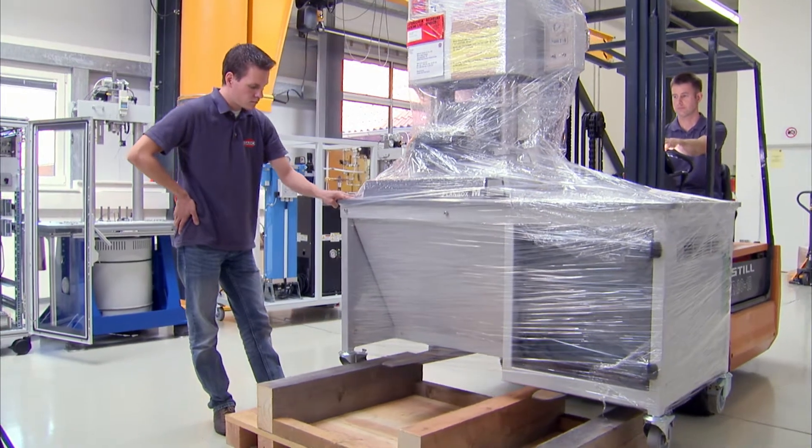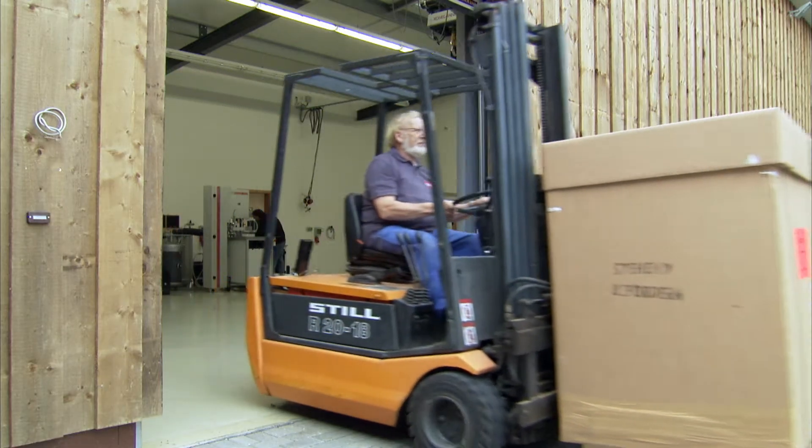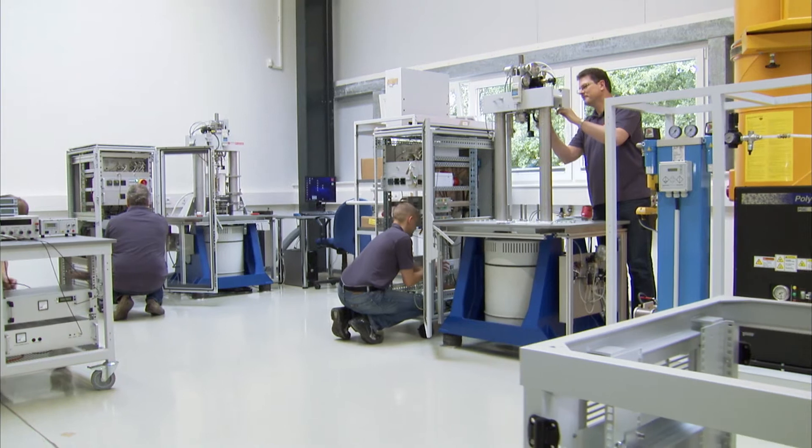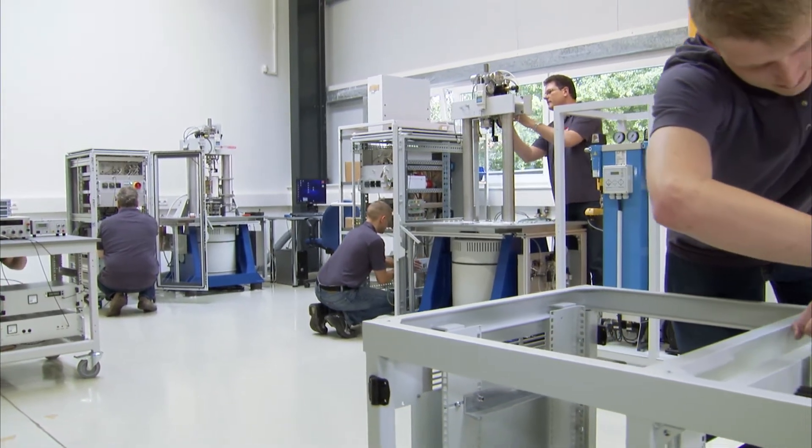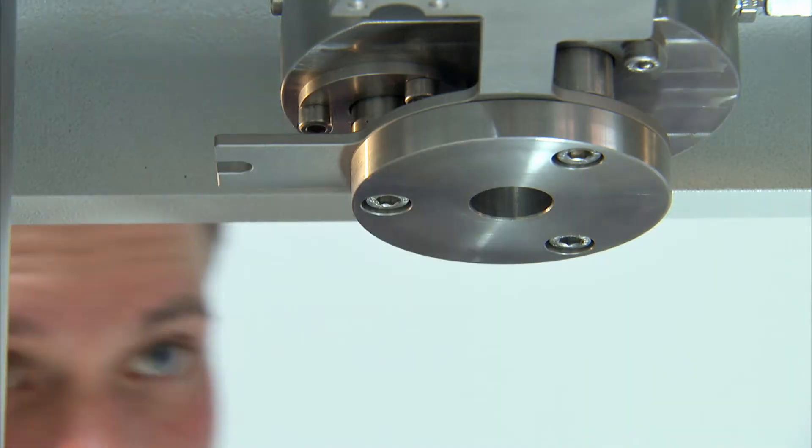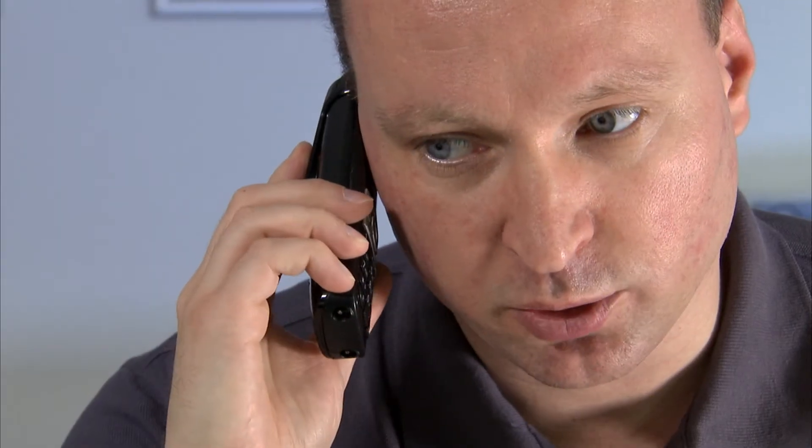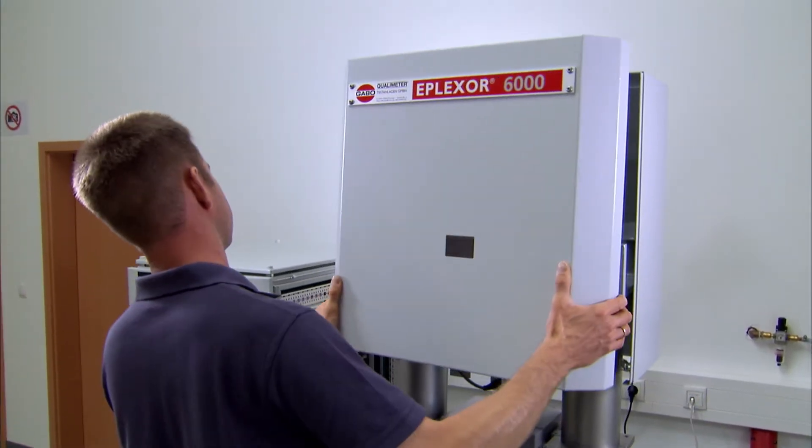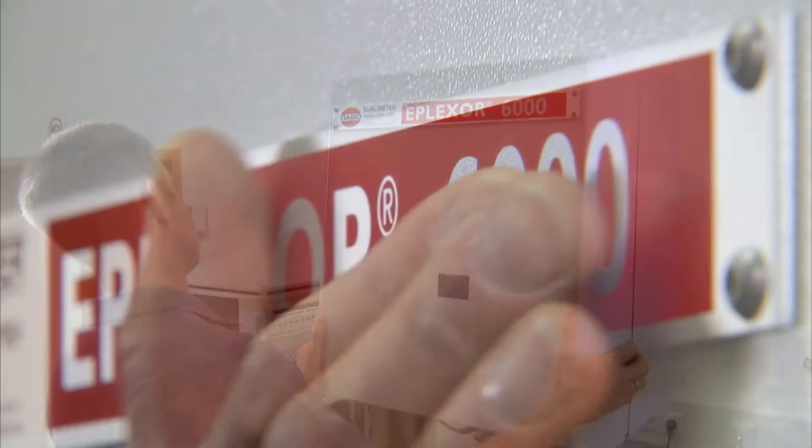Thanks to experience gained by exporting over 400 testing systems to more than 25 countries around the globe, some 25 employees with expertise and personal commitment hold the leading market position in all areas of dynamic material test engineering worldwide.